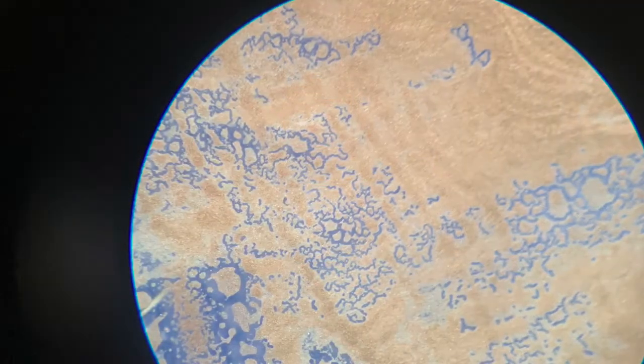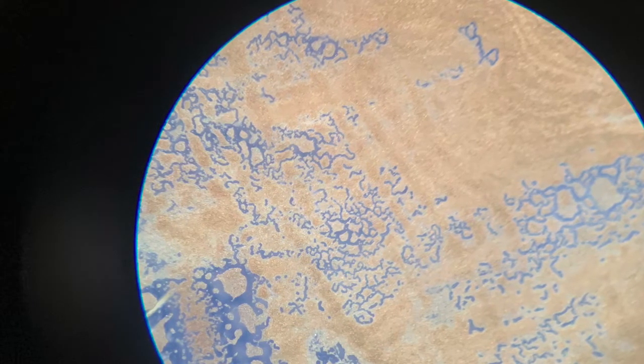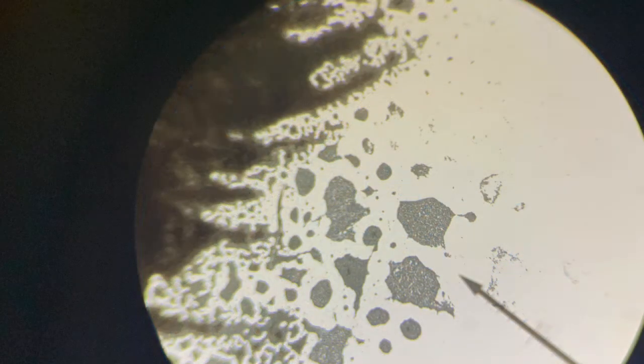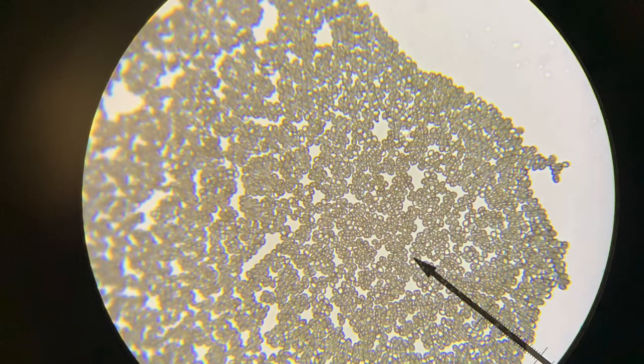These are the spores underneath the stereoscope. The stereoscope magnifies up to about 30 times magnification. Kind of looks like a planet of some sort. These are the spores underneath the compound microscope. This is at 40 times magnification, and I'm going to try and zoom in on the same exact spots each time. Here we are at 100 times magnification, and the individual little spores are starting to be able to be seen. And finally, at 400 times magnification, you can see all the individual little spores there. There are just thousands upon thousands and millions of them on this slide.